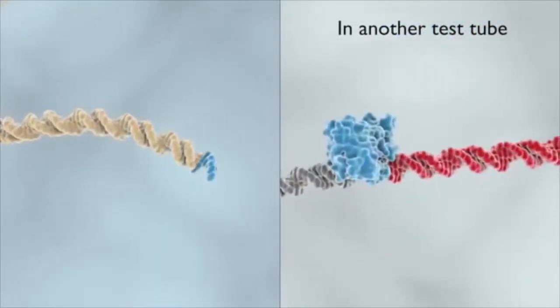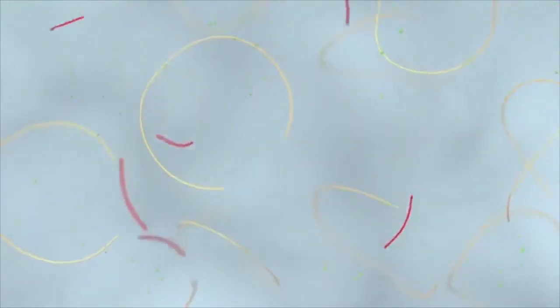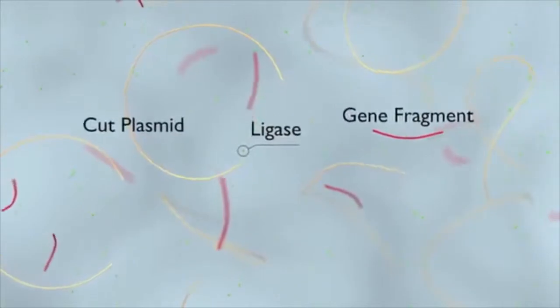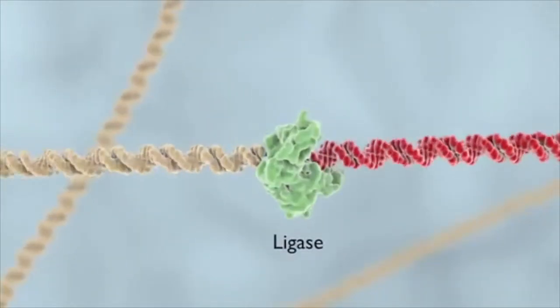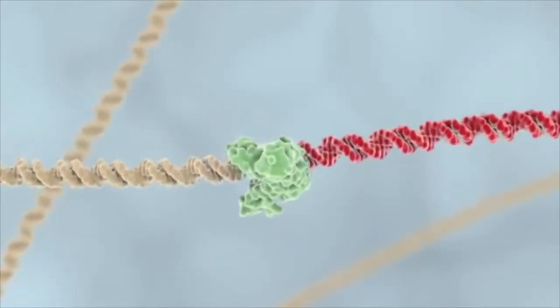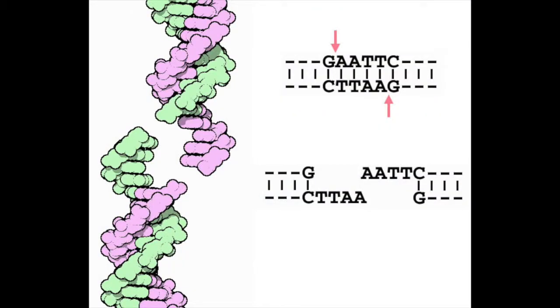Like all enzymes, a restriction enzyme works by shape-to-shape matching. When it comes into contact with a DNA sequence with a shape that matches a part of the enzyme called the recognition site, it wraps around the DNA and causes a break in both strands of the DNA molecule. Each restriction enzyme recognizes a different and specific recognition site or DNA sequence.